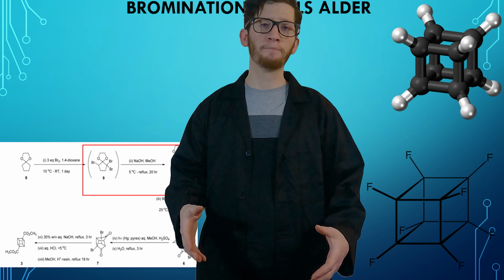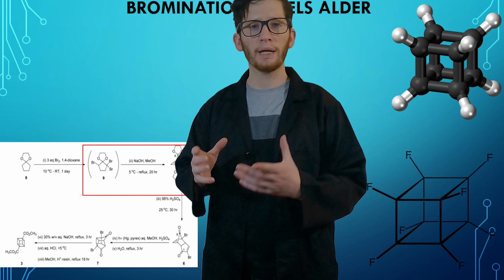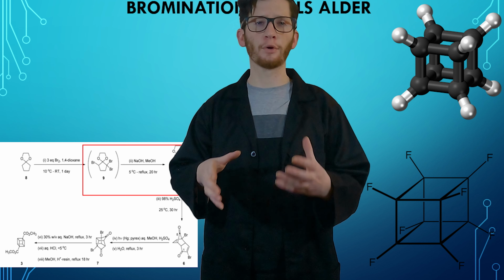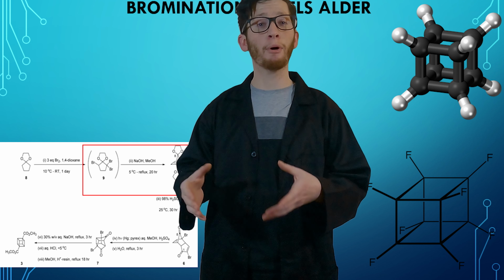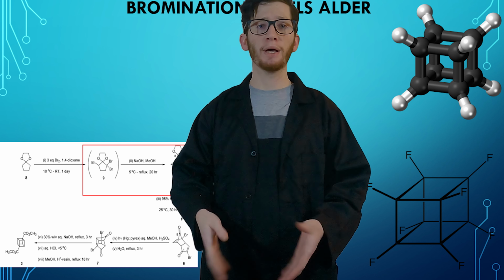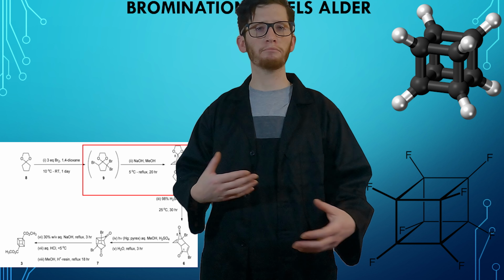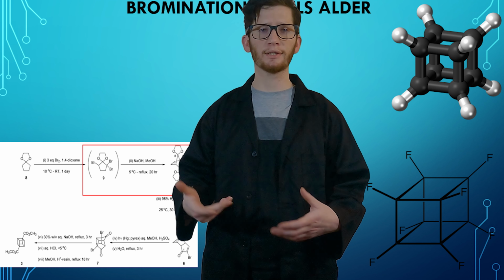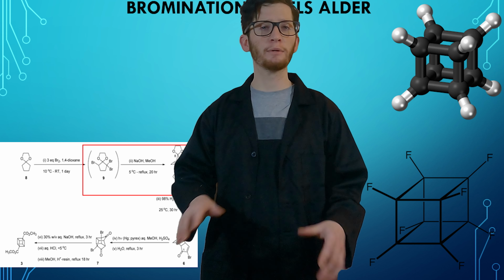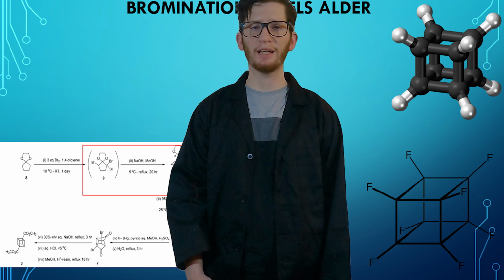So I emailed him, and the misconception there is because after you brominate it at under 30 degrees, because if you go over 30 degrees, you'll ruin it, you bring it to room temperature and stir it for 20 hours. However, we did not cool it back down and added the methanolic sodium hydroxide solution right away, and the temperature fluctuated between 55 and 60 degrees Celsius that entire time, and we turned quite black, made a lot of really, really high grade tar. However, I refluxed it for 20 hours just in case anyway.